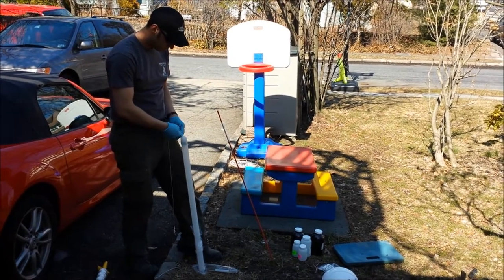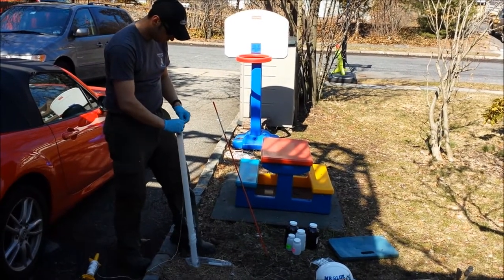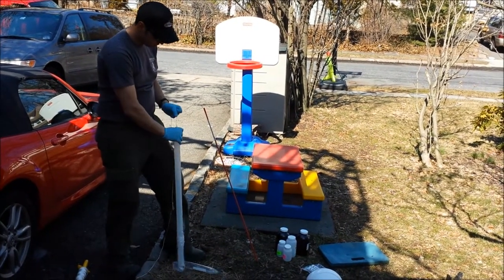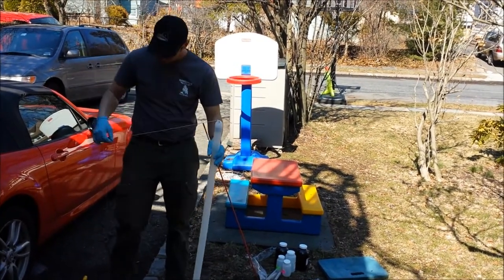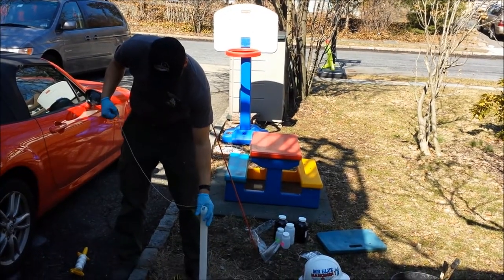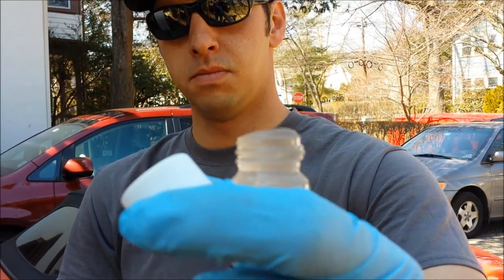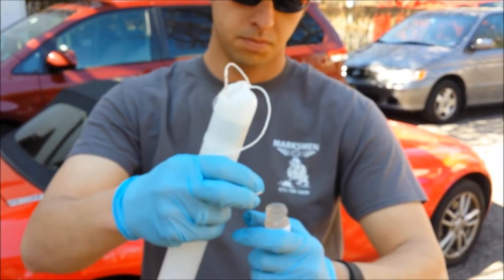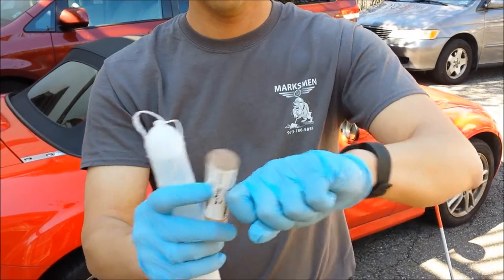Nick's getting ready to collect our first sample. He's getting the bailer all set up, and he's going to collect volatiles first. The DEP field sampling procedures manual says whenever you're collecting a groundwater sample for laboratory analysis, always collect volatile organics first. It's a small 40-milliliter vial — we have to create a meniscus on it because we can't have any air bubbles in it. See how it's rising above the lip? That's good. No air bubble.